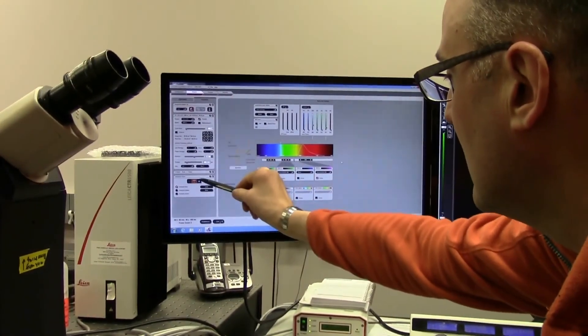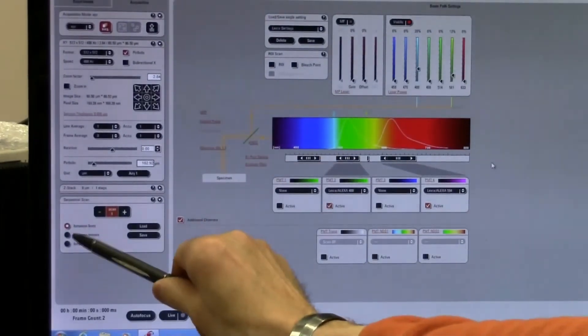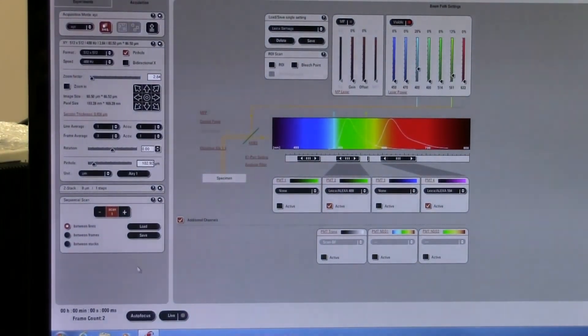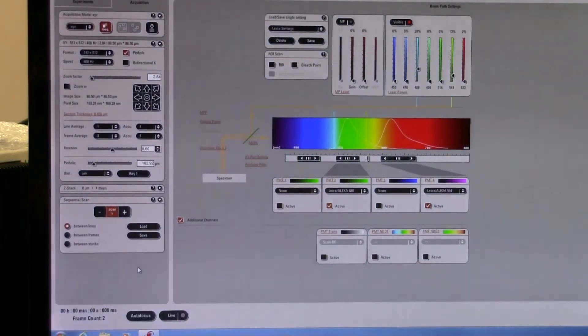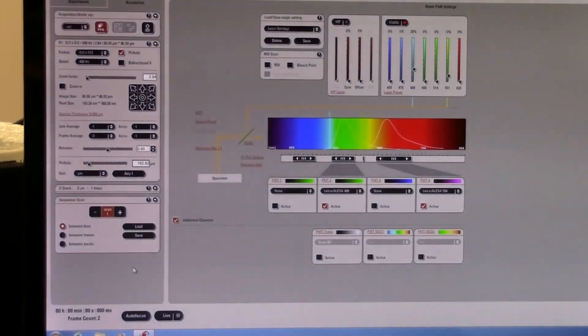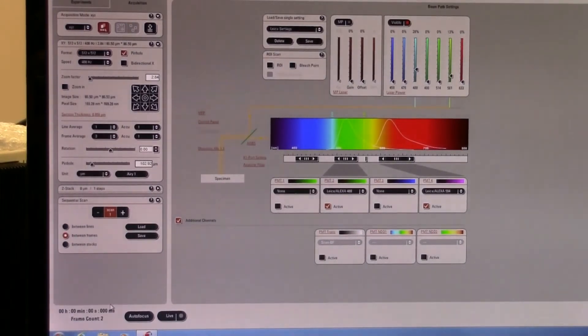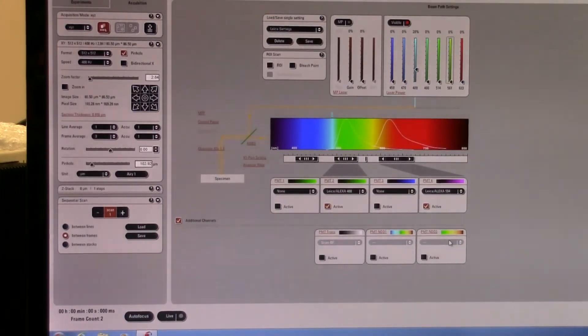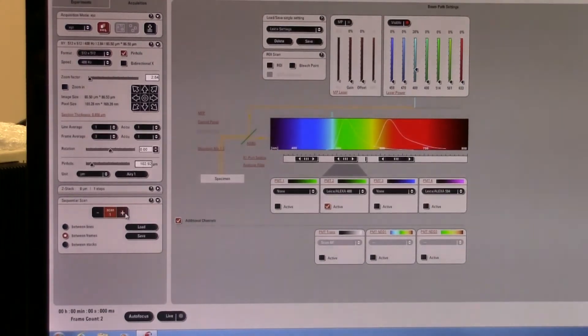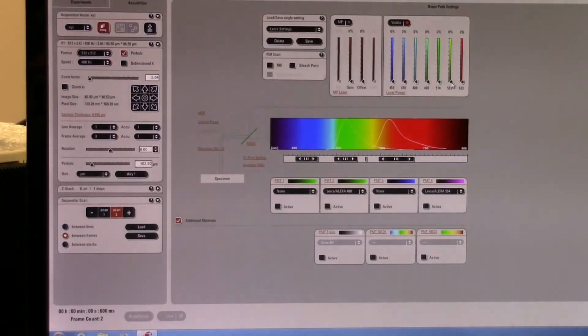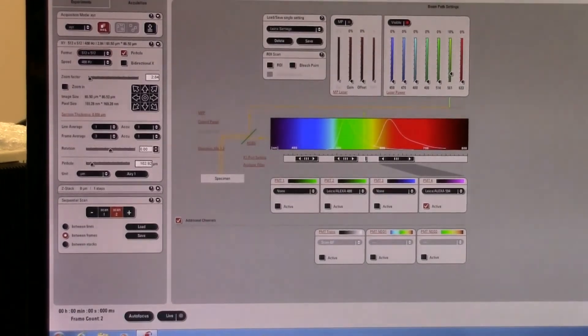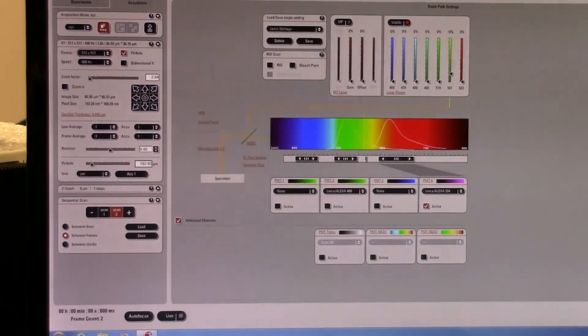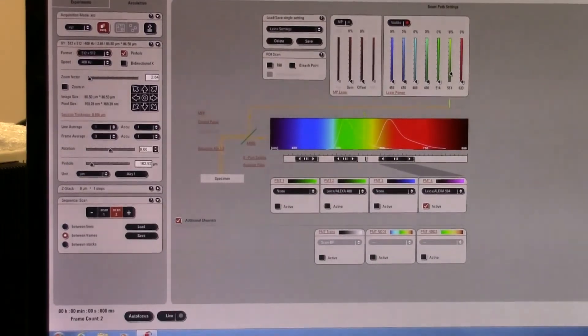We have the sequential scan panel comes up. I prefer to use the switch between frame setting. There is an option to switch between lines, and what that'll mean is with every line, the laser will switch color and scan again with a different color. We're going to do it between frames, so I'm going to select that radio button. We're going to set our first setting, which is just the green, which means I'm going to turn off the red laser and importantly, I'm going to turn off the red PMT and hit plus. Then for the second scan, I'm now going to turn off the green laser and the green PMT and turn on just the red laser and just the red PMT. In the case of this unusual fluorophore set, I could have decided to just leave that laser line on, but I'm going to choose the 561 laser and just that one PMT for the sake of demonstration.